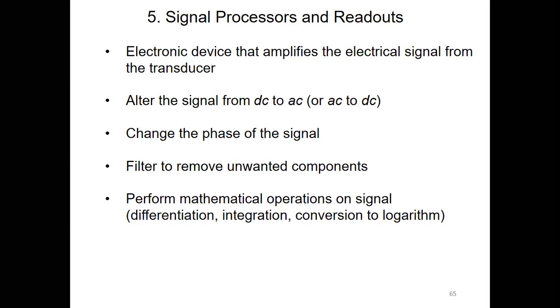But there should be some user-friendly way for us to gather or extract information from this electronic signal which is coming from the transducer. So in that case, we need to use the assistance of the signal processor or readout device.